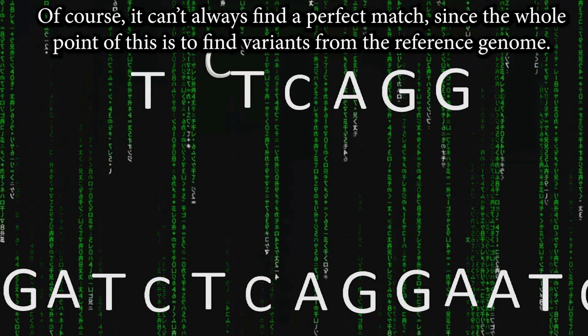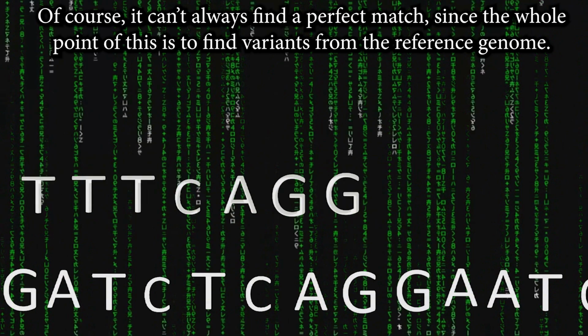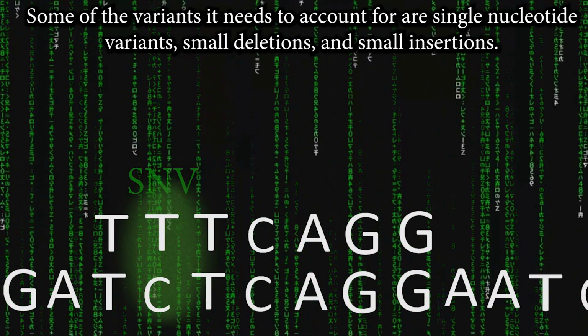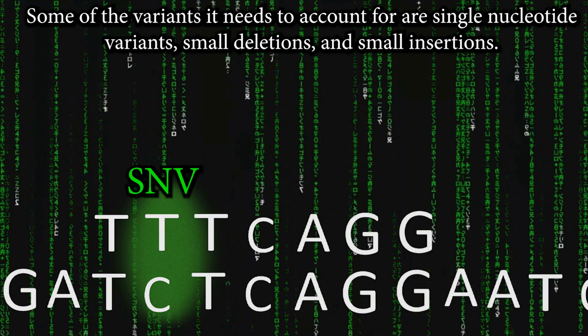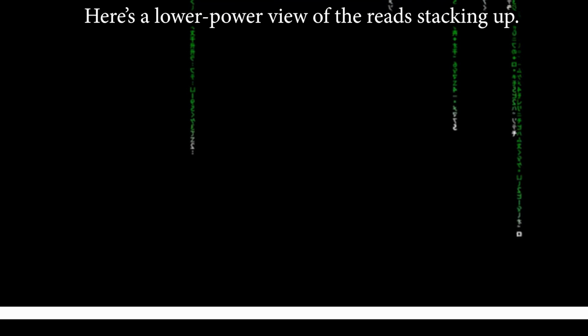Of course, you can't always find a perfect match, since the whole point of this is to find variants from the reference genome. Some of the variants it needs to account for are single nucleotide variants, small deletions, and small insertions. Here's a low-power view of the reads stacking up.